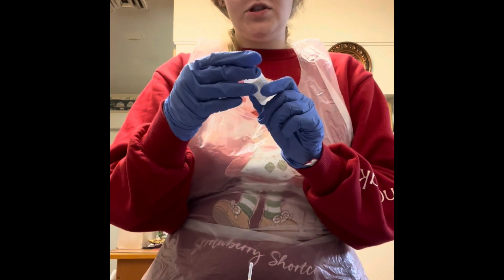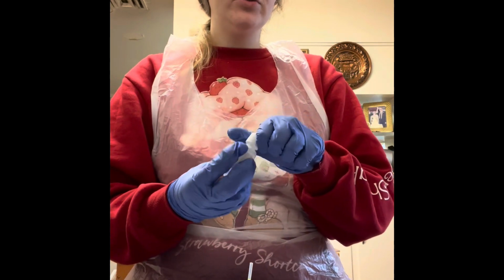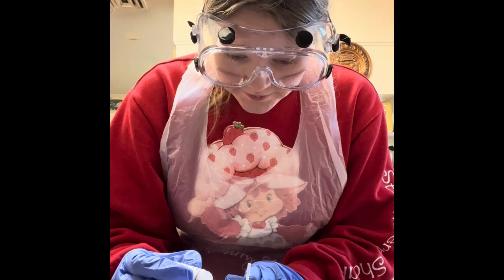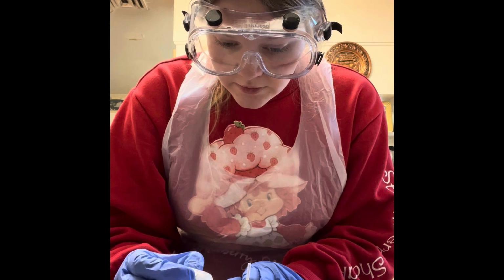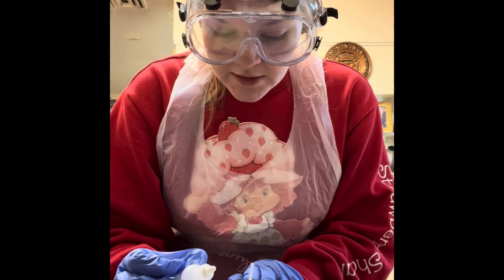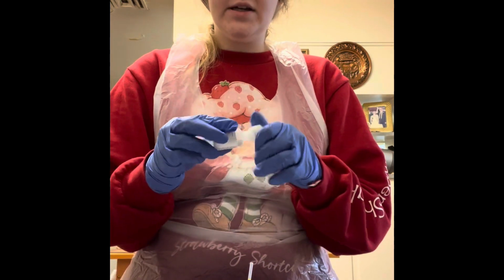So wait, I'm supposed to add the sodium hydroxide, which is the NaOH, first, and then record the colors. And I'm also supposed to record how many drops it takes for there to be a color change. So, 1, nothing. 2, 3, we're almost there. 4, still a little orangey. 5. I think 5 drops did the trick.